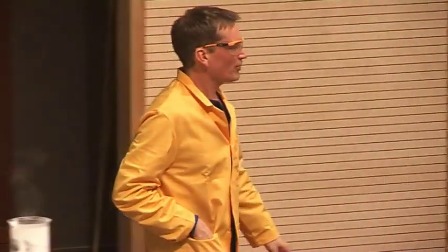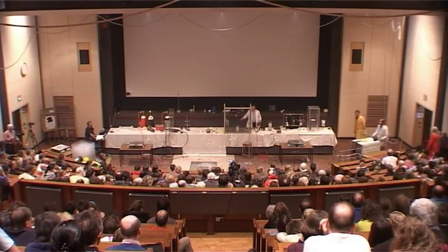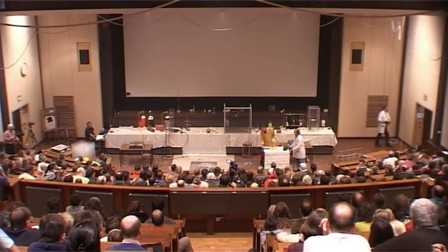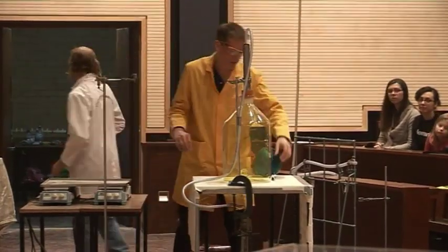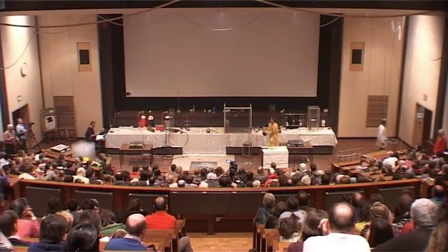Well, we can. Now, Chris has filled up this apparatus here with another gas, chlorine. Now, chlorine is very poisonous, so we've had to take precautions here to absorb any chlorine that's coming out through the apparatus here. But I wanted to show a reaction now with no oxygen whatsoever. Now, in this balloon is another gas. It's a hydrocarbon called acetylene.